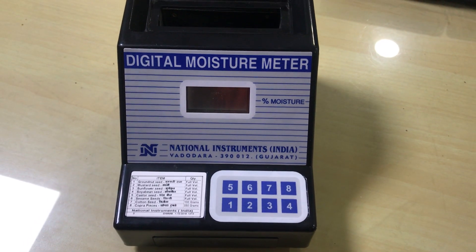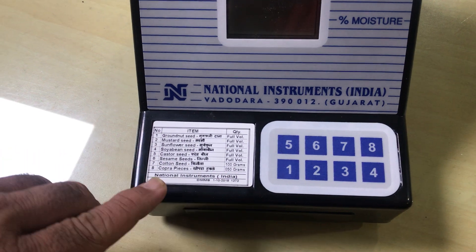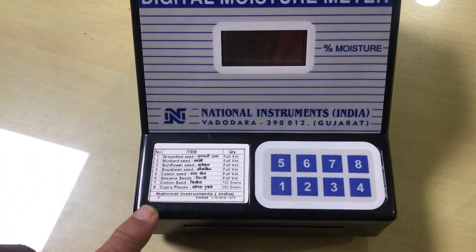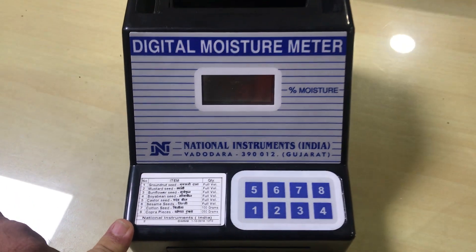This is a moisture meter model DMM8. Various items are listed on the sticker of the moisture meter. You can measure the moisture content of any of the 8 items mentioned on the list.